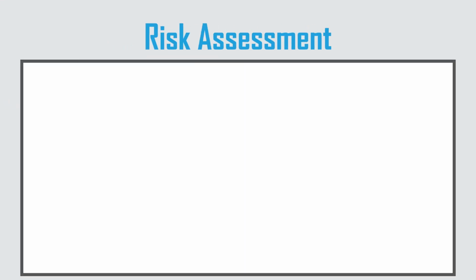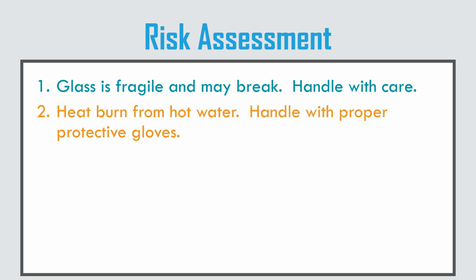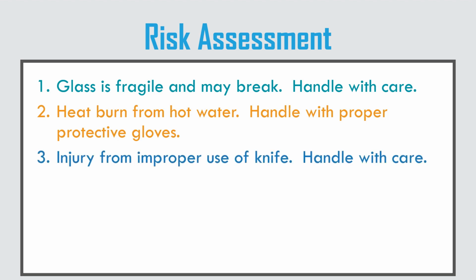For the risk assessment of this project, first, the glass is fragile and may break, we should handle with care. And second, we may get heat burn from hot water, we should handle with proper protective gloves. And third, we may get injured from improper use of knife, we should handle with care too. You can think more risks by yourself.